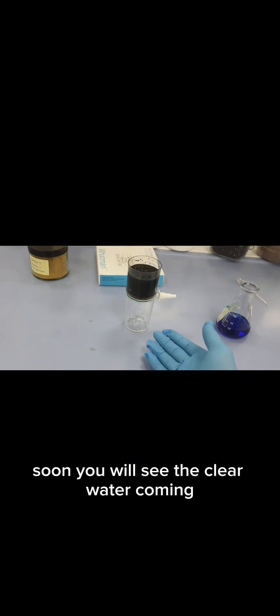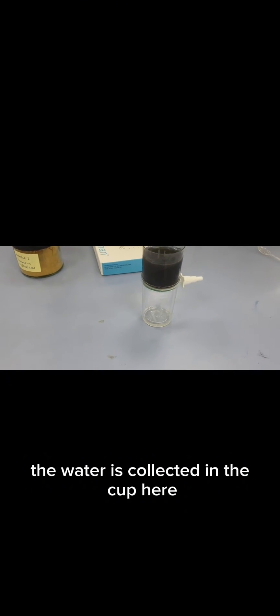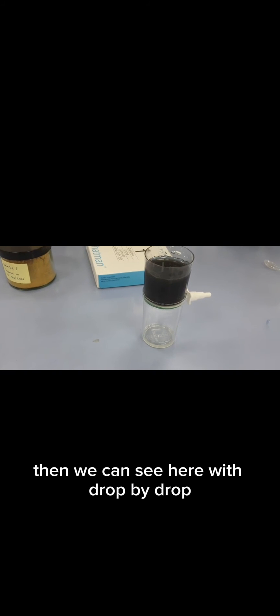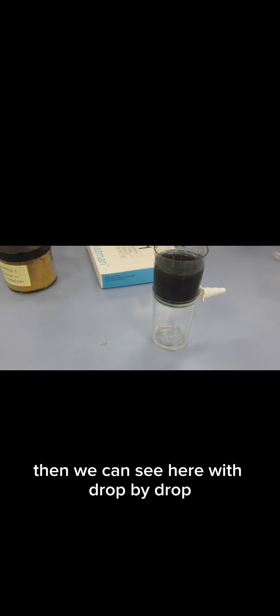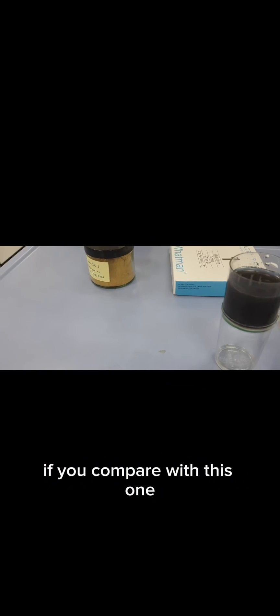Soon you will see clear water coming, collecting in the tank here. Slowly the water is collected in the cup, drop by drop. If you compare with this one, this water is very clear.